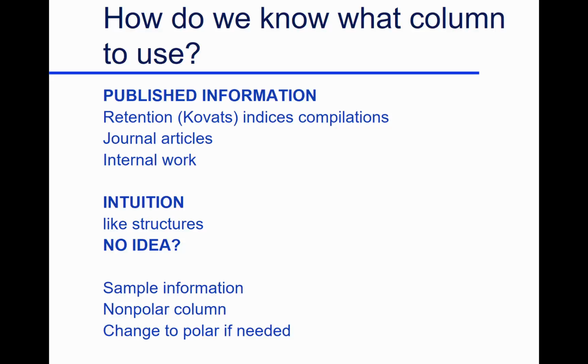If you're working in a company, maybe somebody in the company has seen it before. Hopefully they have a good retrieval system and a good way of keeping track of what they've done. Someone there, or someplace in their archives, will say, we've seen this compound before, this is what it is. So you look out for databases, you look in published literature, you look in-house. If you don't find anything, it's something about intuition.